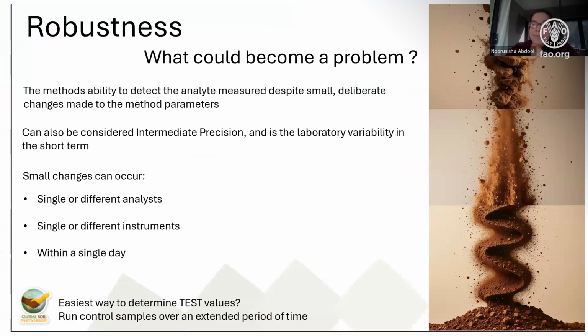Robustness takes a little bit of imagination and a little bit of thinking as to what could possibly go wrong, because we'd all like to believe our laboratories are these perfect situations where the electricity is not going to go, the temperature is going to stay constant, the humidity will stay constant, and my analysts are all having good days every day, so they're not going to take any shortcuts and not verify my balance and all these things. But the reality is that that is actually what happens.